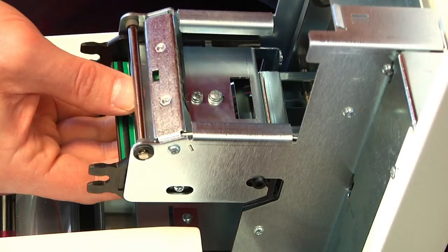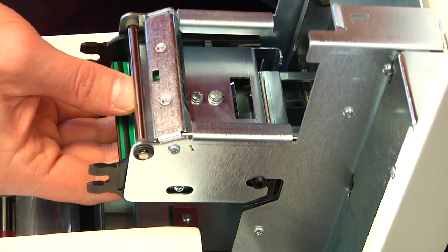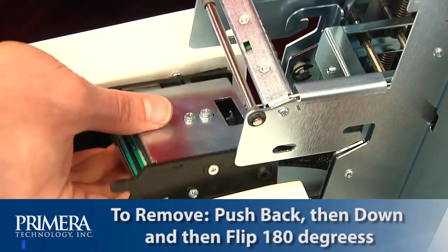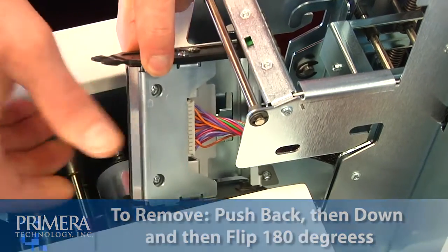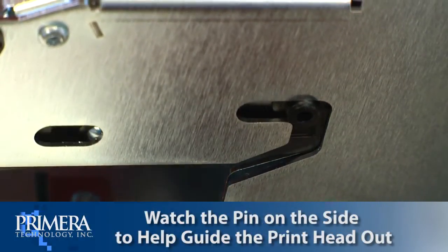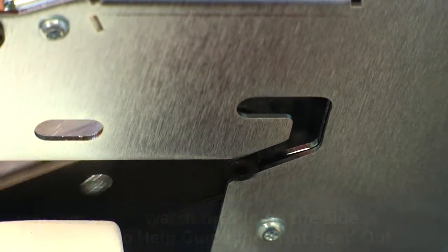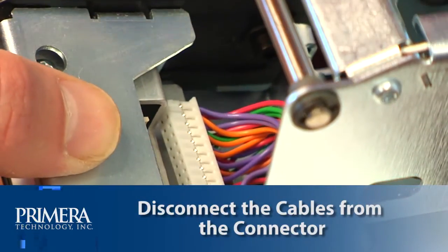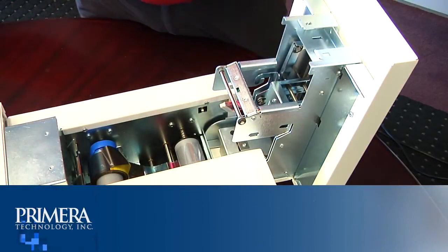Locate the printhead mounted to the underside of the cover. Push back, then down, and then flip it 180 degrees to reveal the cable connector. Watch the pin on the side of the printhead mechanism to guide the printhead out of the metal housing. Disconnect the cable from the connector, then pull on the cables to remove the connector.